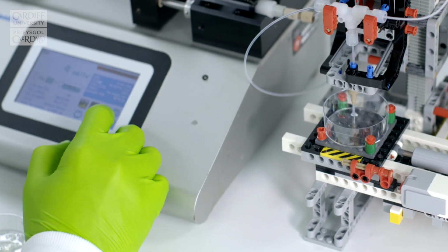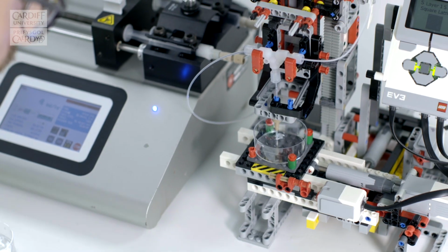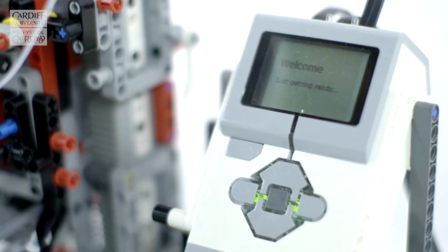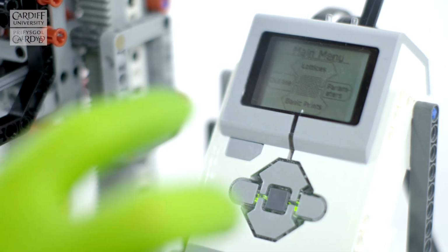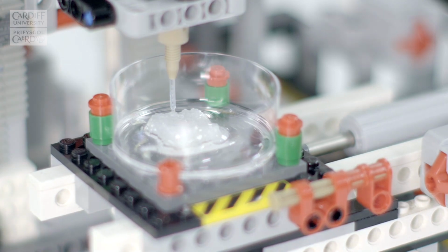And the important finding for us really is that we can get the resolution that we need using this simple, low-cost equipment in order to build tissues potentially that are extremely complex.